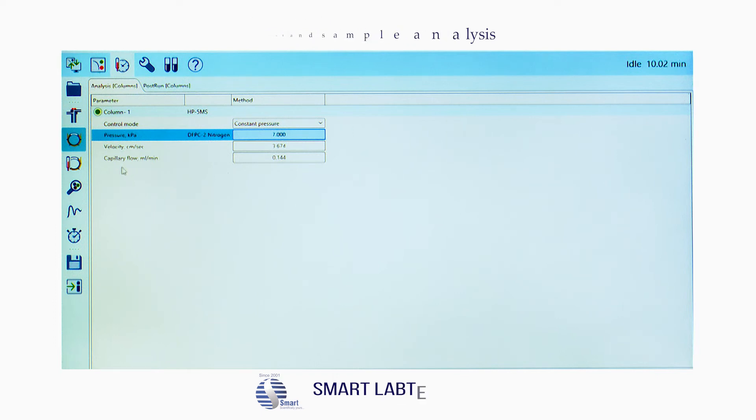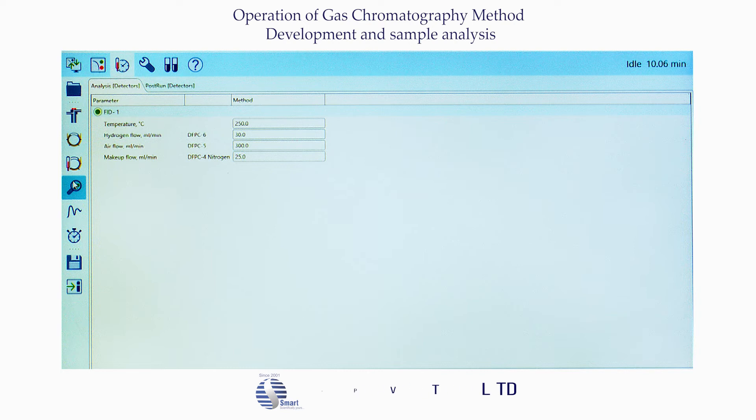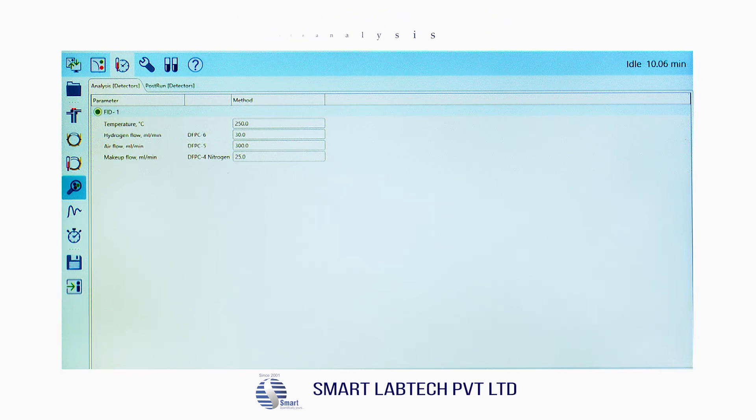Then click on the detectors icon — FID1 appears. Feed 250°C against temperature. Set hydrogen to 30 and air to 300 — for the highest sensitivity, maintain a hydrogen-to-air ratio of 1:10. Feed 25 for makeup flow in ml/min. Then save the method by clicking the save icon below.